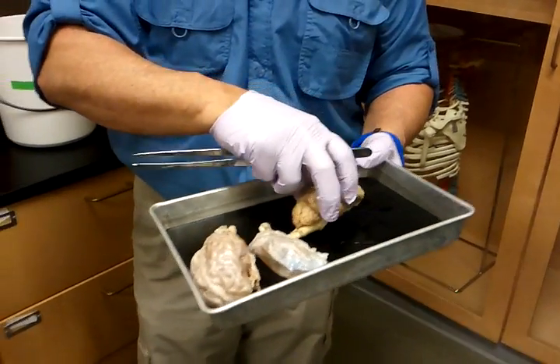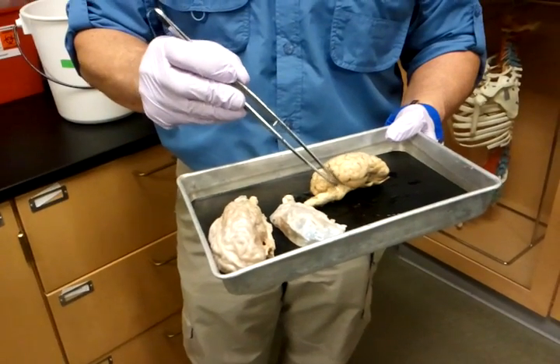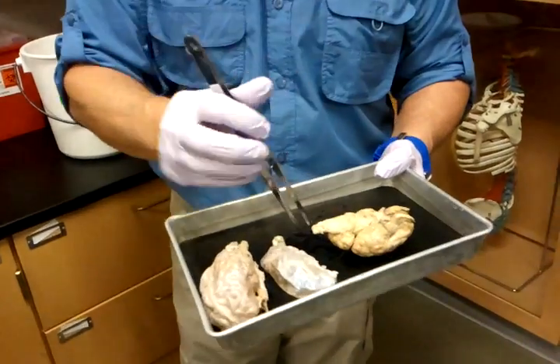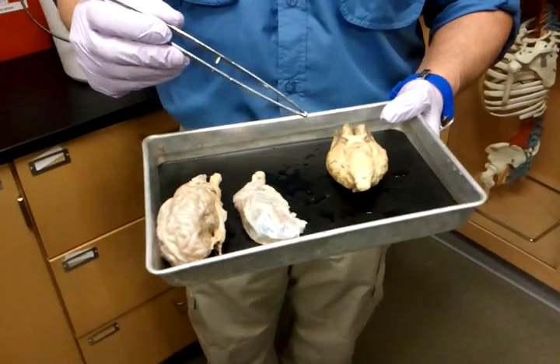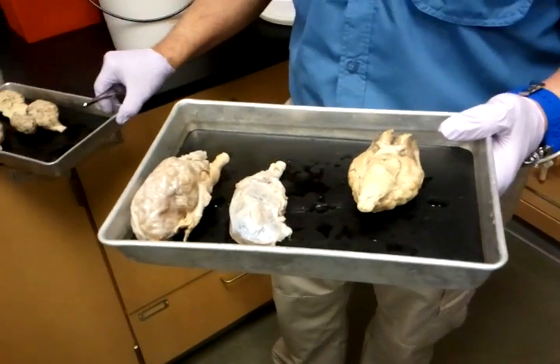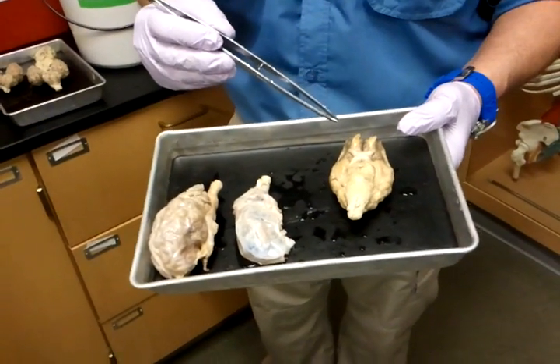Once you know the vocabulary from the human brain, this is not hard at all. What's the one that separates cerebrum and cerebellum? Transverse. Yeah, there you go. Now, you do an inferior view, we can take all of these. Most of these sheep brains have been trashed. It's hard to find ones that still have cranial nerves intact. Some of these over here may be a little bit better. If we're going to ask you that, we'll get you one that's better to ask you different parts of.